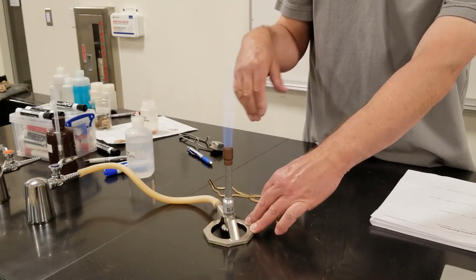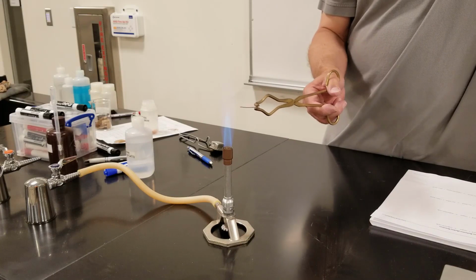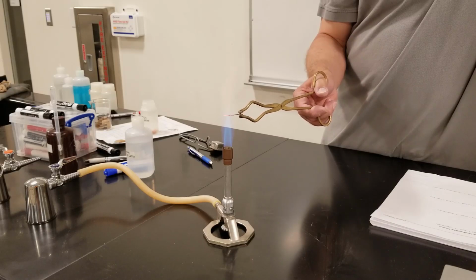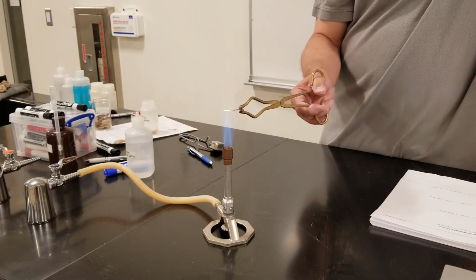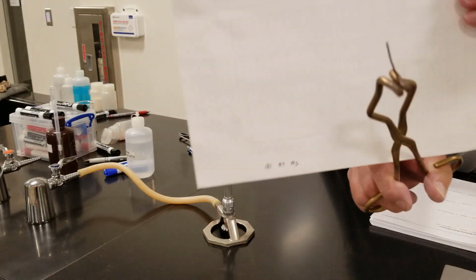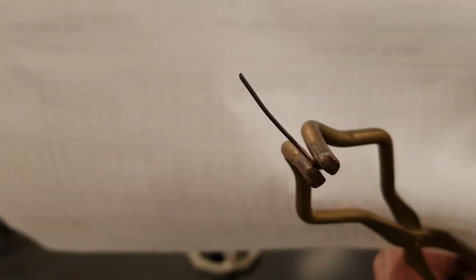Notice I'm not putting my hand through that flame. So now we have a nice hot flame, and we're going to take our copper metal, put it at the very tip of the inner blue cone until it glows red. It's glowing red hot now. And I'll take it out, and hopefully you can see it's no longer that shiny copper metal. It's now kind of black. And that black that you're seeing is copper oxide. So that's copper 2 oxide that's formed because it reacted with oxygen in the air.